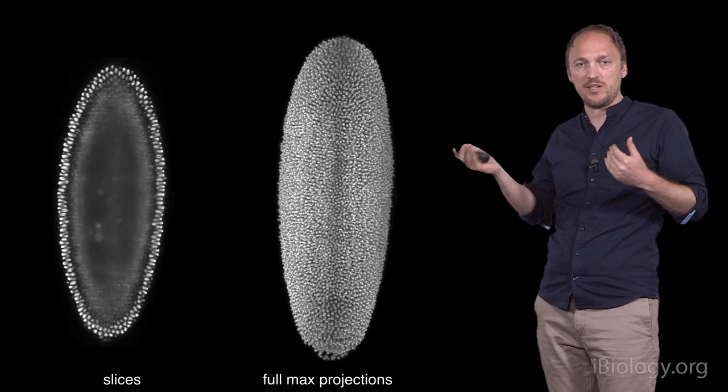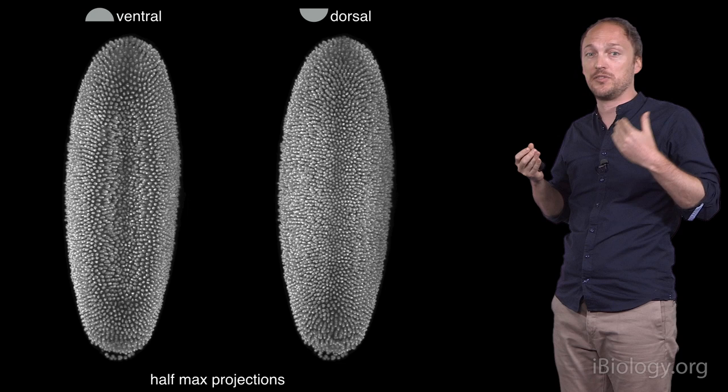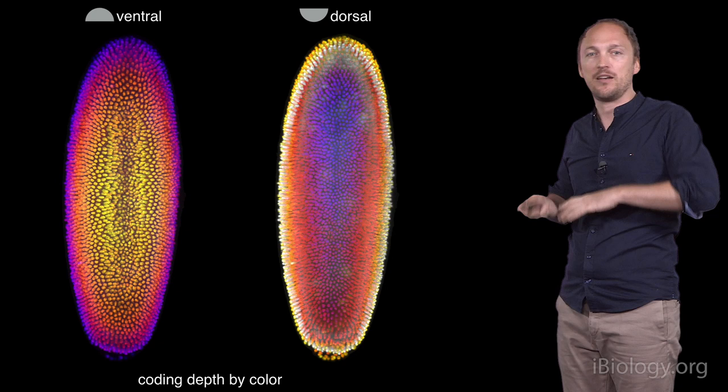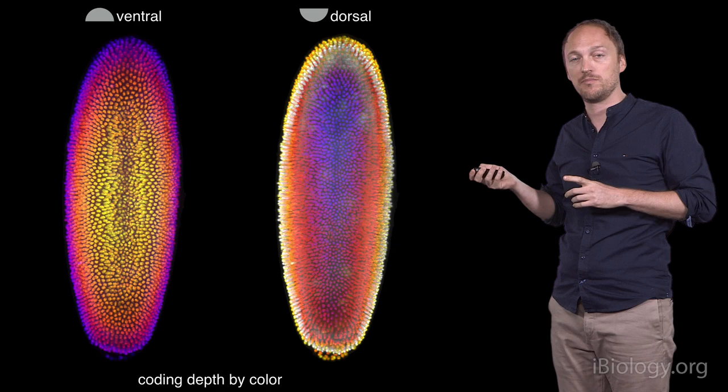We can also display these slices over time as a movie, or project all the slices by taking the maximal value for voxels along the Z direction. However, a lot of details from the dorsal and ventral side of the embryo get projected together into a single 2D image, leading to confusion. Instead, a better idea is to project only half of the stack at a time, into two distinct ventral and dorsal projections. Another possibility is to project and color code the depth of the visible pixels to convey depth explicitly. However, color is oftentimes a poor conveyor of depth.